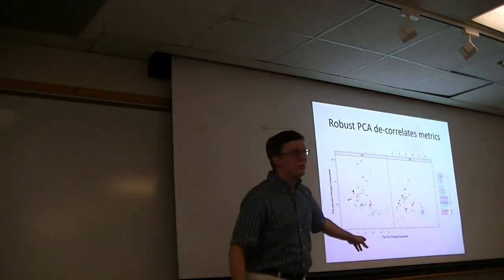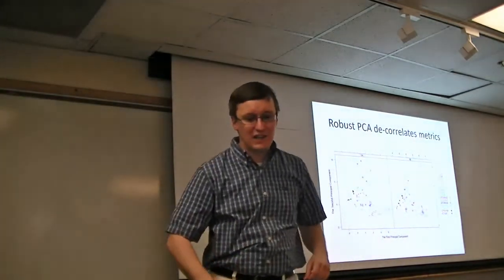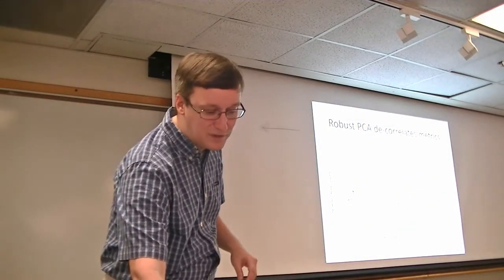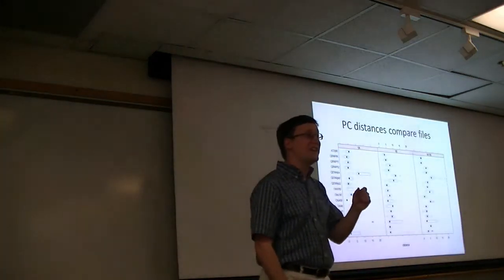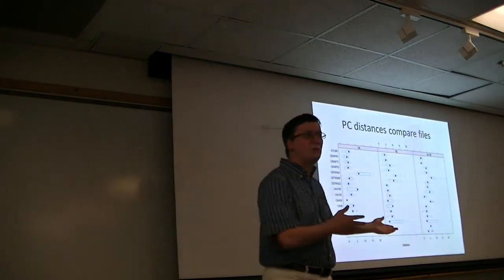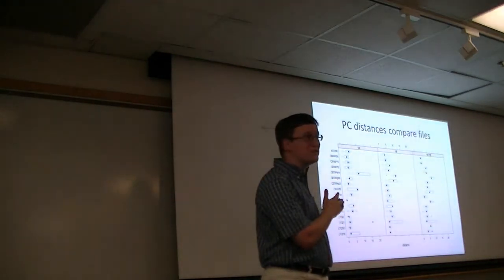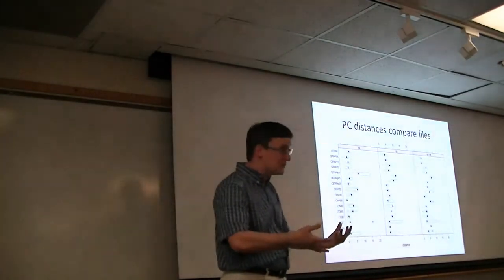All right, so with something like this, we can visualize these quality metrics across lots of files, lots of experiments. But we can also do nice things like find outliers this way. And what I'm talking about here, yes, this was used in proteomics, but this is just as applicable to LC-MS/MS volumes from metabolomics. So I'm going to spend a little time here.